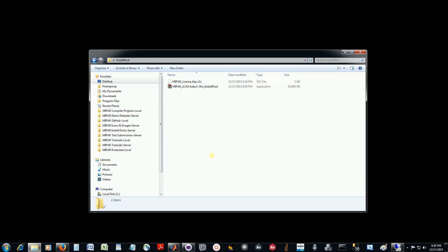Welcome to the MyPAR tutorial for installing MyPAR. Thank you very much for registering to be a beta user. We are thrilled that we were finally able to get MyPAR into your hands. I'm just going to quickly run through the procedures for installing and activating MyPAR.